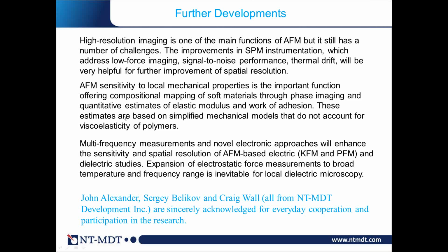Then we can do a lot of work on the local mechanical properties, and go to extreme spatial resolution situations, which other methods really cannot do much with. Also, there are a lot of advances going on with electric and dielectric measurements, and that will be a pre-announcement of the following seminar, where we can put more emphasis on how to optimize measurements.